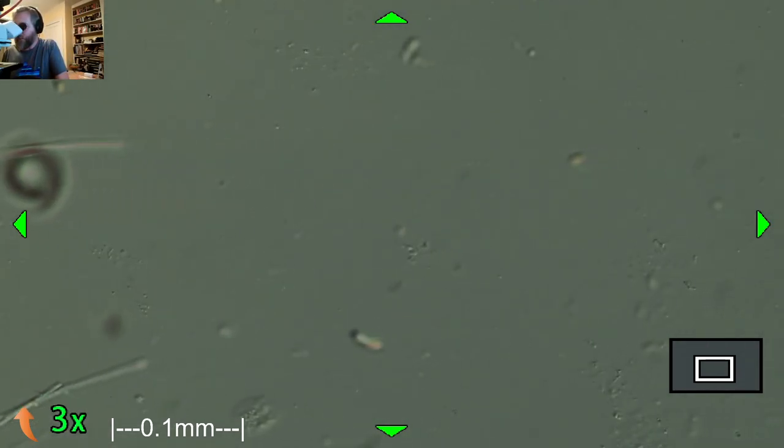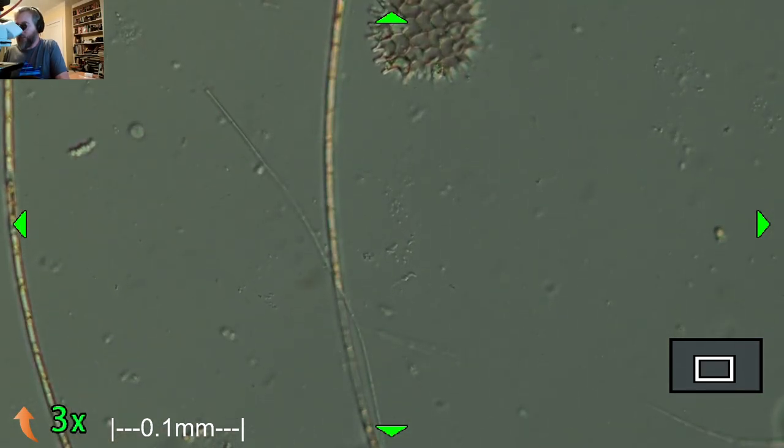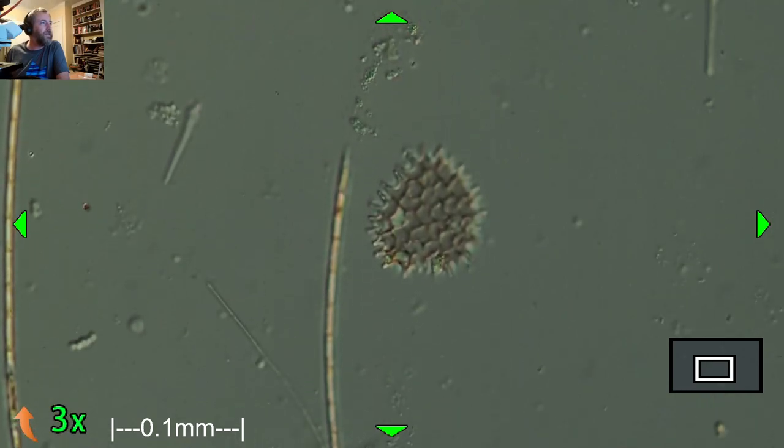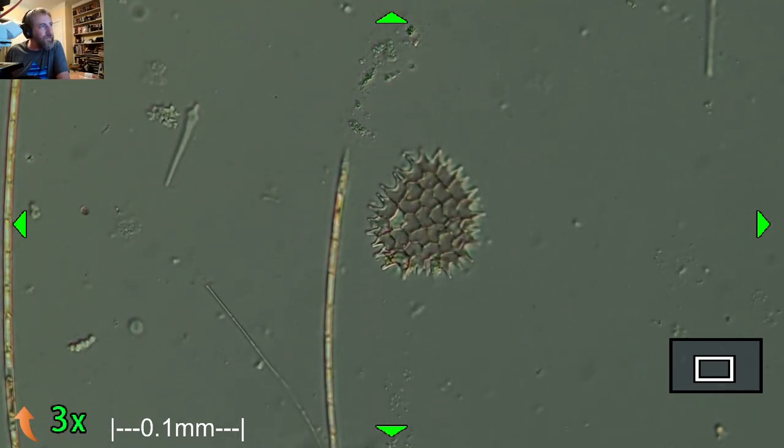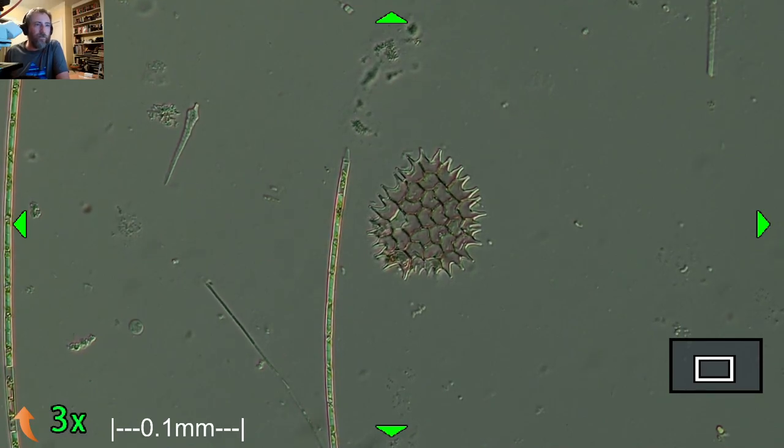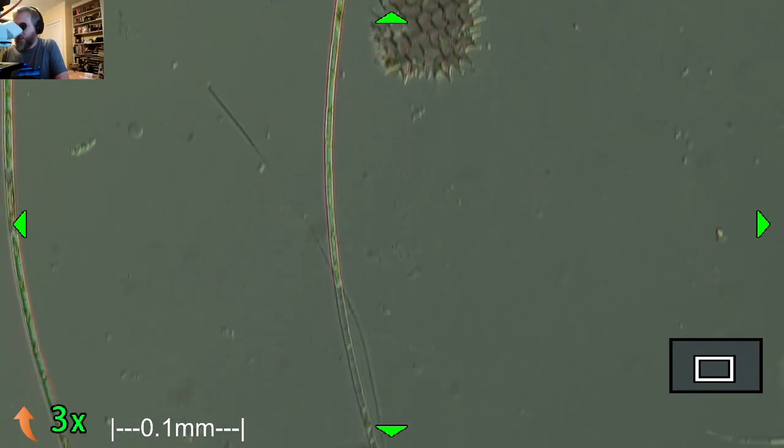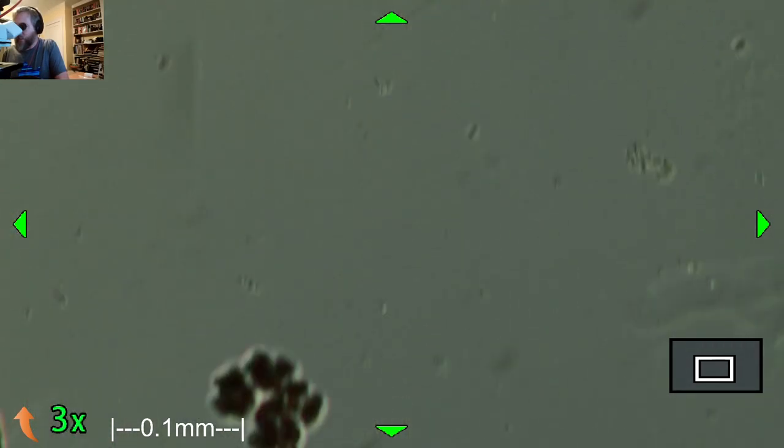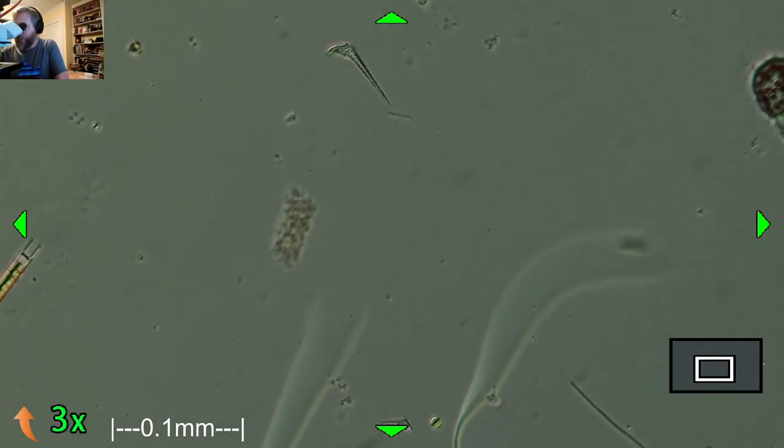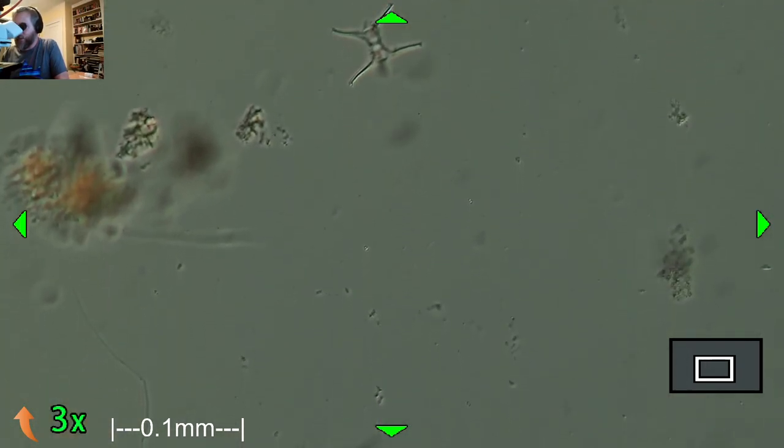And then so there's some Pediastrum. Some of the chloroplasts are missing from it. Right there. So you can see each of the cells has like two little horns, if you want, that come off of them. And then there's a bunch of the Aulacoseira all around here. Oh, that's a Staurastrum right there. It's a type of desmid.